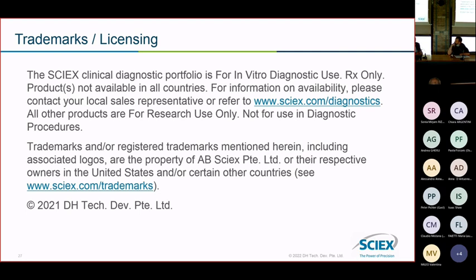Well, I can tell you that the original paper on Zeno pulsing was from 2009. Only when it's available can you work with it. So Zeno increases the overall signal tremendously on the MS/MS. That creates needs for development on the hardware side. You can see that now we are exceeding the scanning SWATH data on the TripleTOF with higher robustness on the Zeno. And if you read the conclusions of the Markus Ralser paper on the Zeno TOF, one of the things he highlights is that scanning SWATH is compatible with Zeno pulsing. So he opens up the door to its implementation along with Zeno.